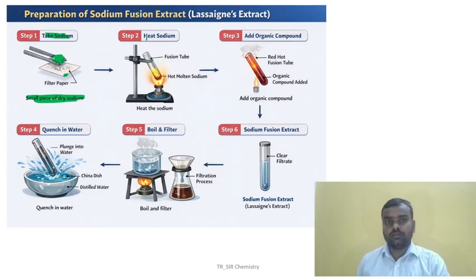Now in this tube, we start heating the sodium, right? Hot molten sodium will be forming. It's converting into liquid form, molten, at high temperature. Then add some amount of organic compound.